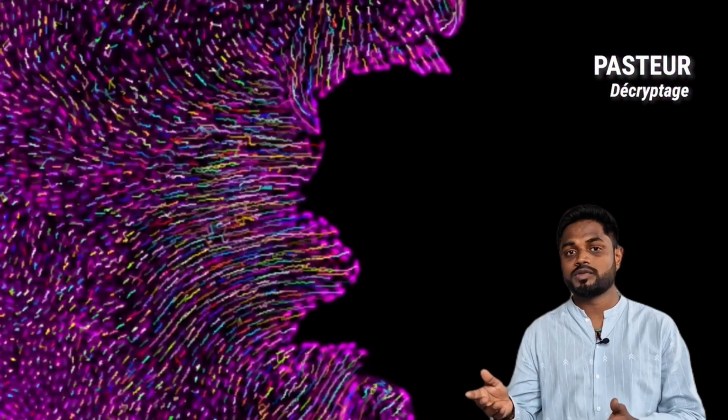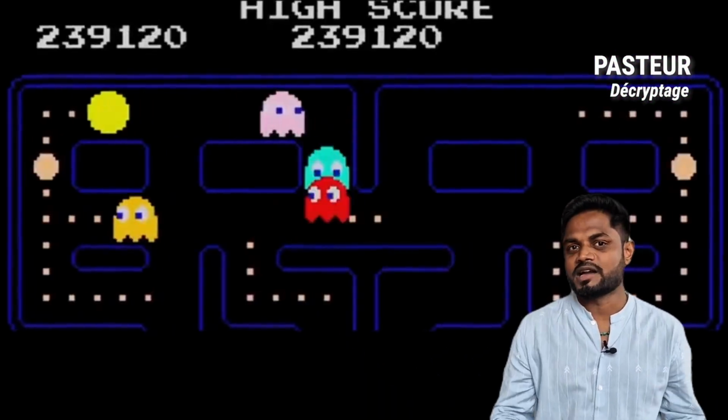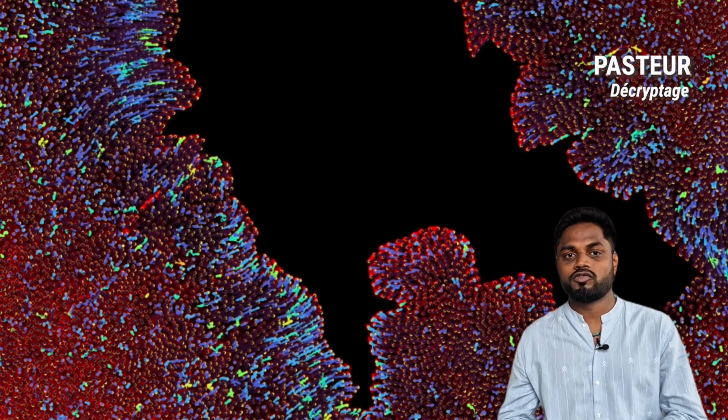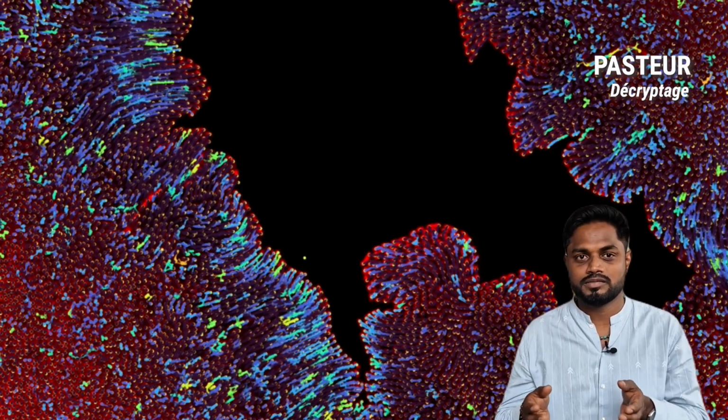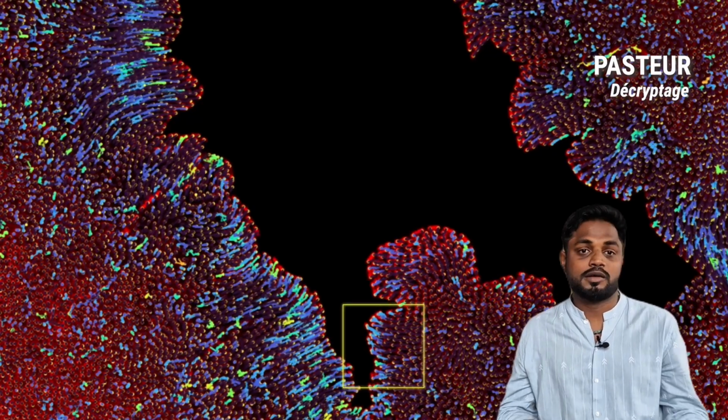I'm a computational mechanobiologist. Don't swipe it, it'll all make sense in a few seconds. These images were taken in a confocal microscope. This movie here lets us zoom in and see how these tiny organisms multiply. Do you know the game Pac-Man? Here we couple the video with the software that acts like the detective in the game, spots the bacterium, tracks them frame by frame like a tiny player in a microscopic maze.